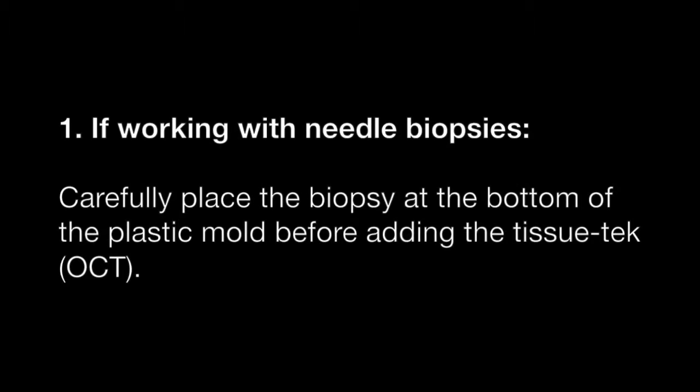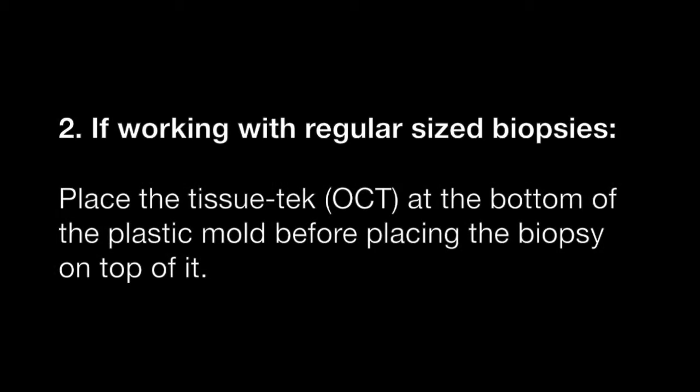If working with needle biopsies, carefully place the biopsy at the bottom of a plastic mould before adding the tissue tech. If working with regular sized biopsies, place the OCT at the bottom of the plastic mould before placing the biopsy on top of it.